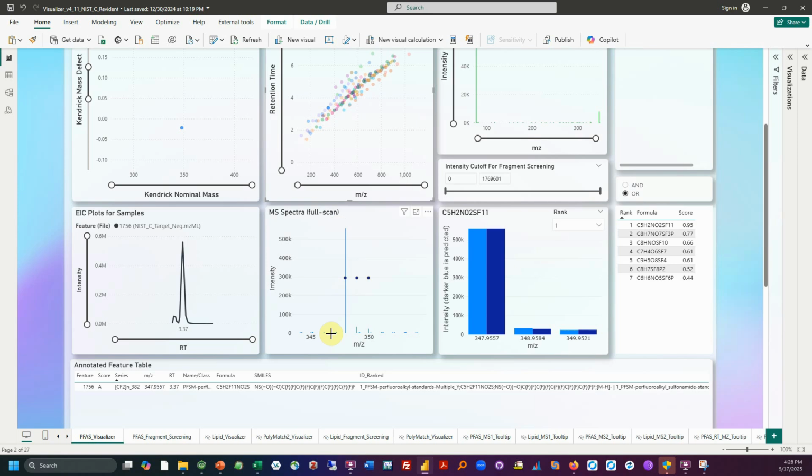which is if you look at the isotopic pattern, which is very nice, and this is the MS1 spectra, you want to look around the MS1 spectra and make sure that there were no other peaks that were co-isolated within plus or minus 0.5 daltons, so that our spectra actually belongs to this molecule, which is true in this case.